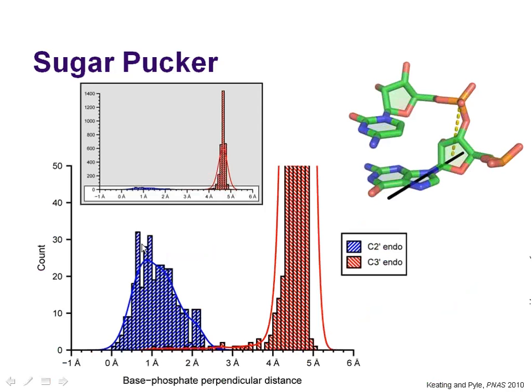I should point out that this technique is the same thing that's used in MolProbity. So if you feed an RNA structure into MolProbity, and it tells you you have 11 sugar puckers that are questionable, it's using this same metric. And I can't take credit for this. This was developed in the Richardson lab, and as you can see from the plot, works very, very nicely.